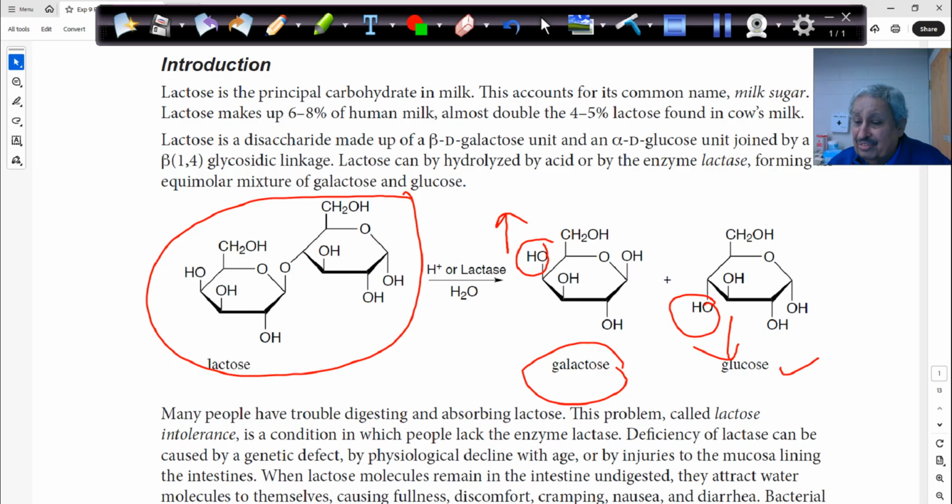Now, we cannot follow the enzyme activity using this molecule. Why? Dissolving it as a solution will lead to a colorless solution. It's very hard to follow. However, we'll be using the Spec 20 as you have it on the bench. I'm not going through the details of how to use it, but I will come to every group showing how we can do it. It's not difficult. So let's save some time on this.